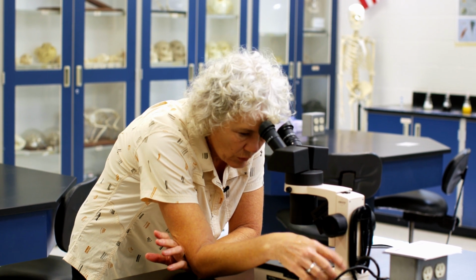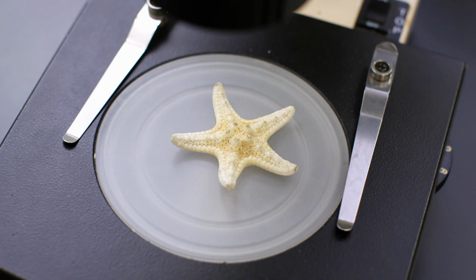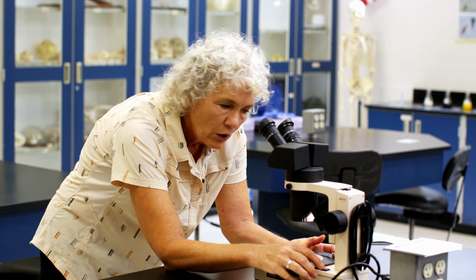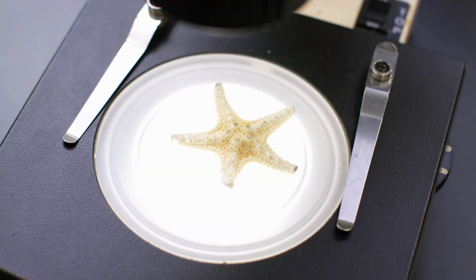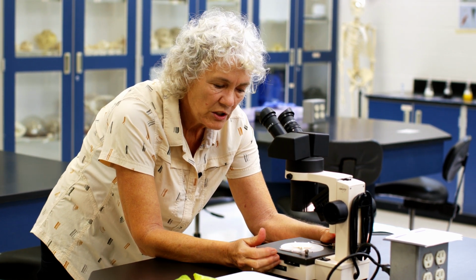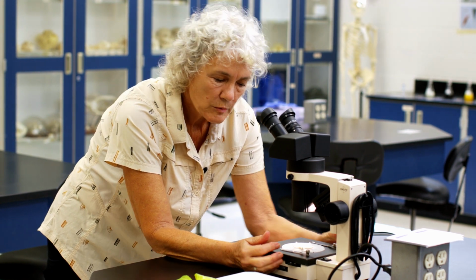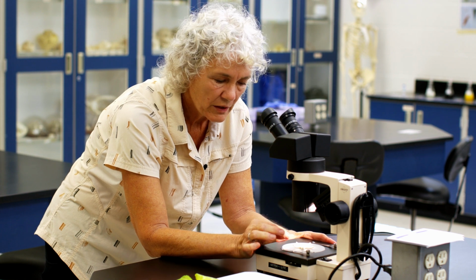So in this case, what I would do is I would look through here, I would get it in focus. And what I would want to do is I have two choices in terms of light. I can be just top light, or I can be just bottom light, or I can be both top and bottom light, right? So the bottom light is especially useful if you have an object that you can see through. The top light is especially useful if you just have an object that is fairly opaque, like this one.